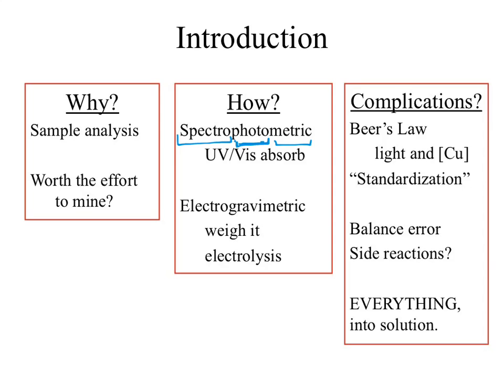So what we're looking at is a light picture measurement. Kind of neat. What we're going to be doing there is using ultraviolet and visible light. In fact, we can cross out the ultraviolet. I don't think we hit ultraviolet. We're going to use just visible light to determine our spectrum, to see how our sample responds and hopefully be able to tie that back to concentration.